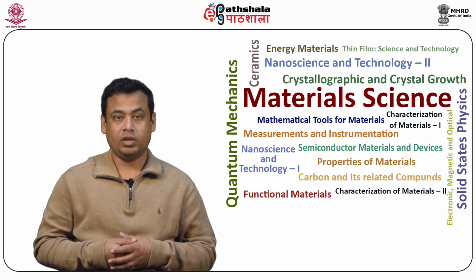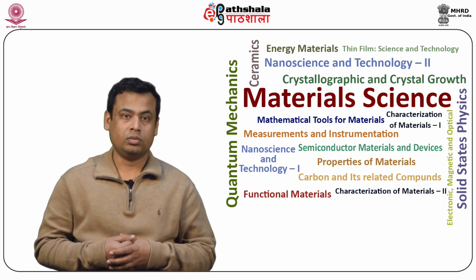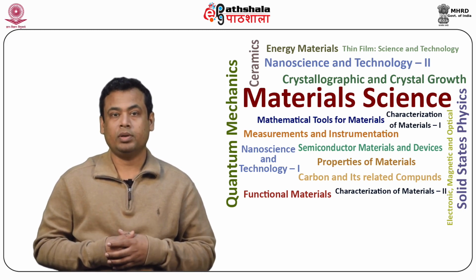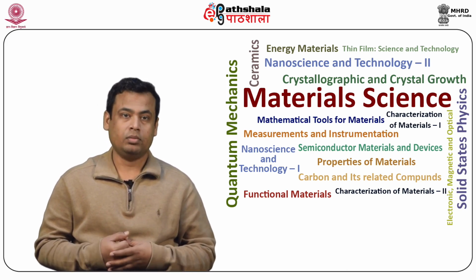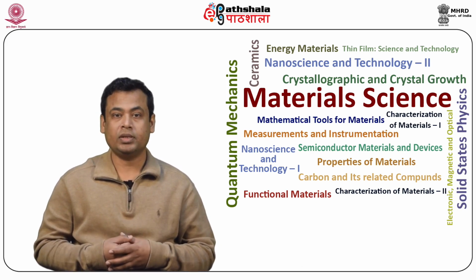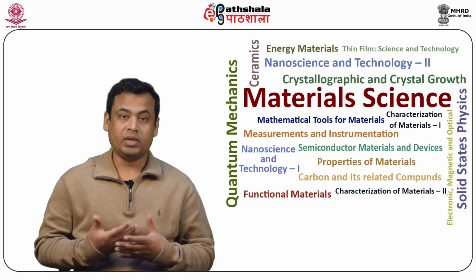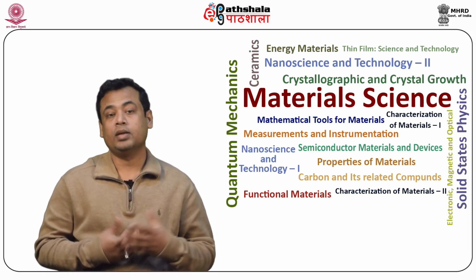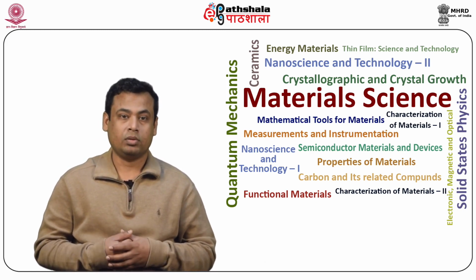Using multiple types of filters or monochromators depending upon the type of fluorescence spectroscopy will come out. The primary filters that excite the sample provide appropriate wavelength necessary, while the secondary filters monochromate the emitted light when sent to the detectors. And the third main component of the spectroscopy is detector.